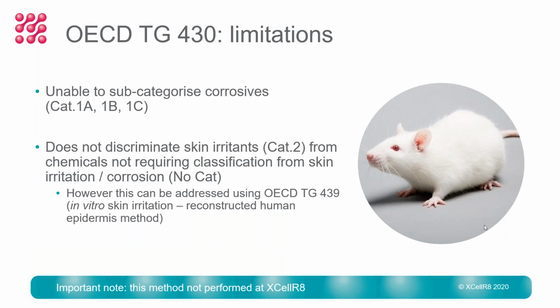So just to sum up, there are some limitations of this method. It's unable to subcategorize, and just for completeness, just to state here as well that this method also is not able to distinguish between category 2 skin irritants or no category. Next slide.